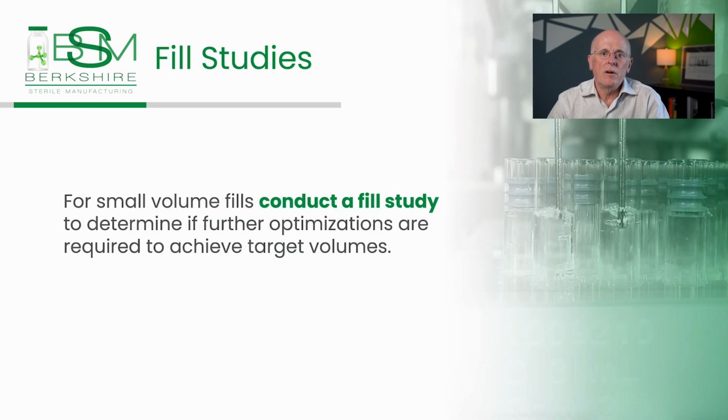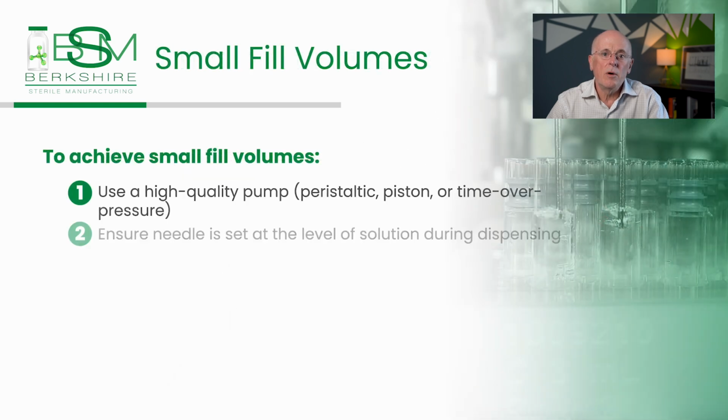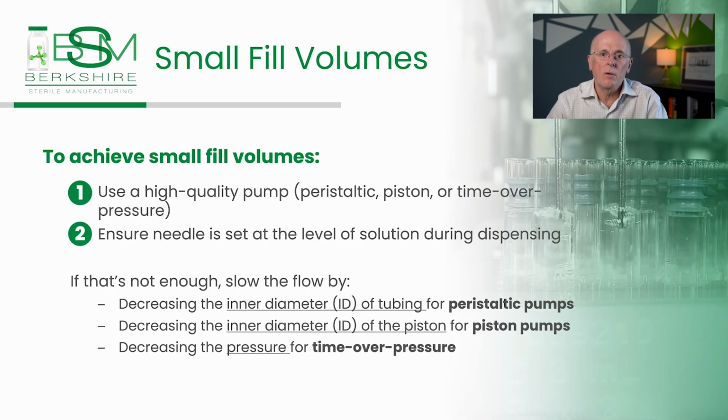For very small fill volumes, the best practice is to conduct a fill study to assess whether you can consistently achieve the desired fill volume. If challenges arise, the CMO can optimize the pumping system to ensure the target volume is consistently met without significantly extending the fill time. In the case of a time over pressure pump, you can reduce the pressure to slow down the solution flow, making it more manageable to achieve accurate and consistent fill weights. Given these solutions, your CMO should be well equipped to consistently meet your target weight checks, provided they possess high quality, validated equipment to support your project.